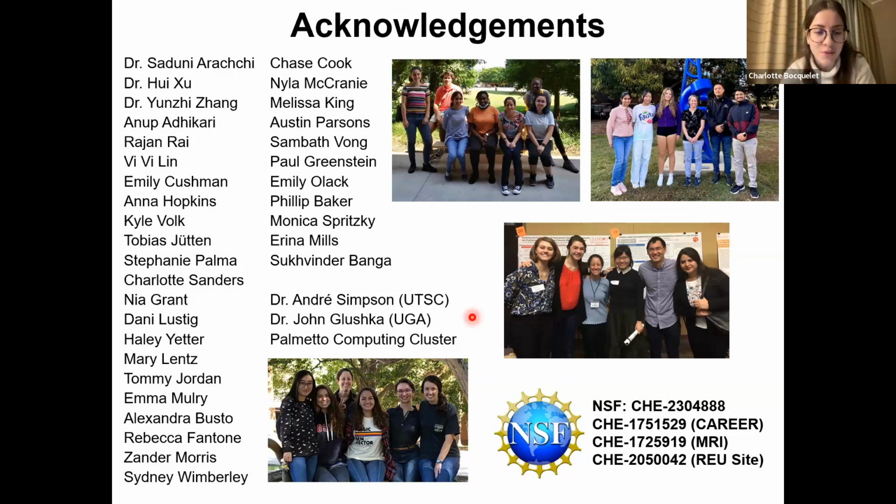If I may have another question, but it's a bit out of the topic. For the polystyrene beads, you said they seem to be porous, but I think in your article you didn't mention any pores with these particles, right? So was that a surprise because it's commercial, is not specifying it's porous, but you observed it was porous. And is it possible to know with N2 absorption, for example, the pore size of these particles?